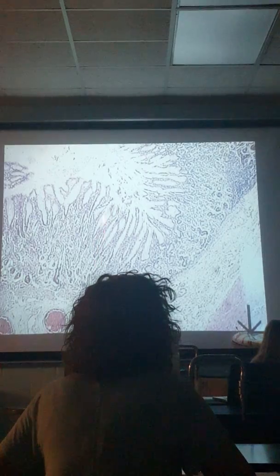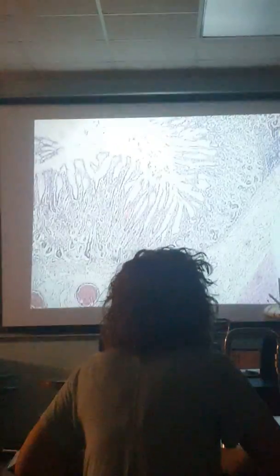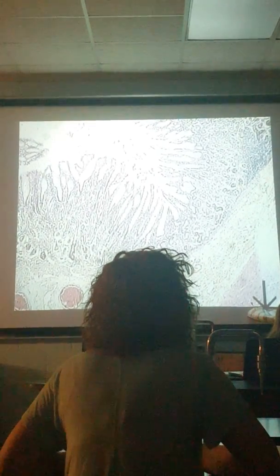We've got the gastric pits. And down here we have the chief cells, parietal cells, and the neck cells all here. A bit of the lamina, or muscularis mucosa, ending the mucosa layer. This is all submucosa, and then the muscle layers. There are 3 muscle layers in here: innermost oblique, middle circular, and outermost longitudinal. So they're all there. So this is stomach.